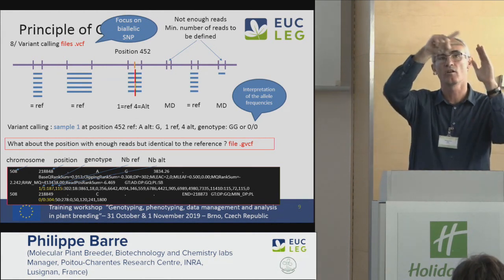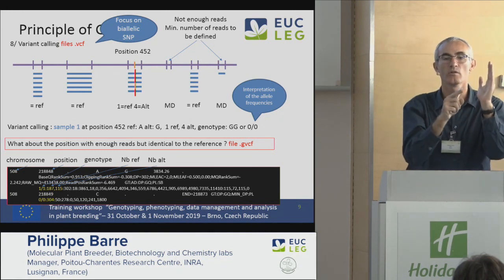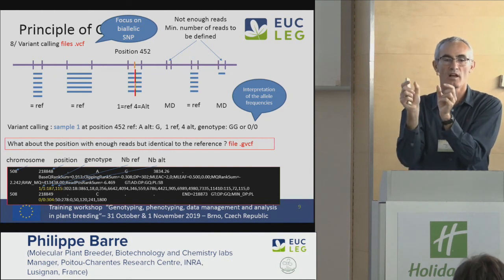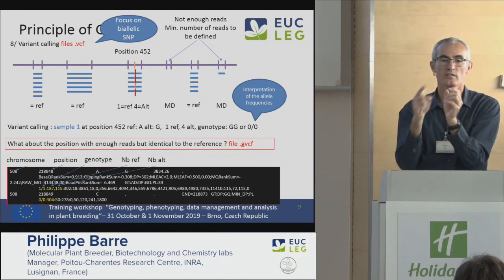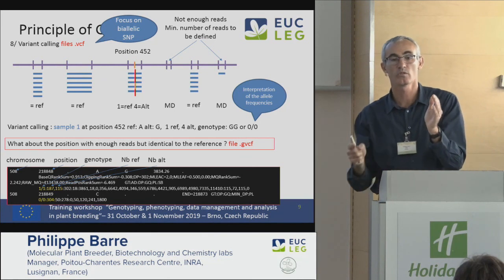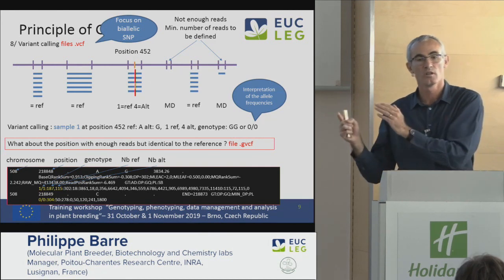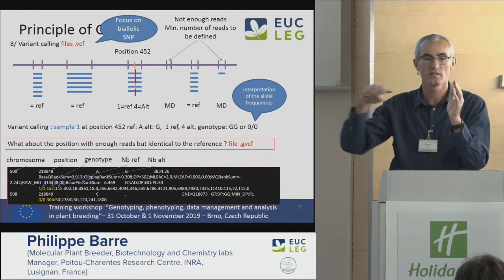If you have like here a lot of homozygous 0, and then something like this, and this, and this, okay, I can say here, I will cut. And I keep some security, and I say from 0 to 0.22 maybe, it's homozygous 0. And then from 0.3 to 0.65, it's heterozygous, like this. But if you don't see, I check that.